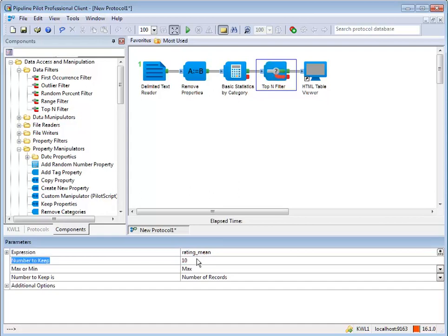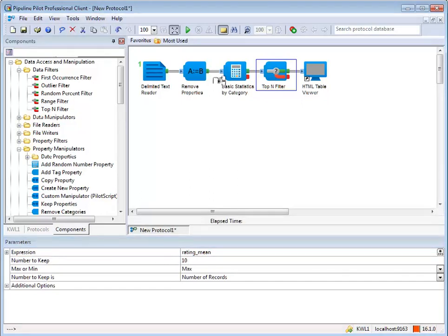If the component is creating a branch from the existing pipeline, the cursor changes to the branch icon.